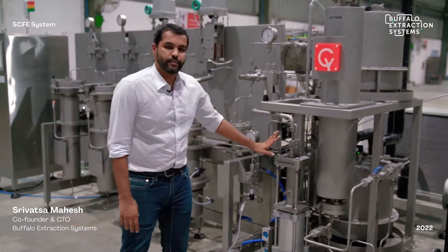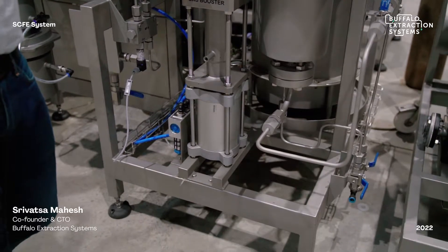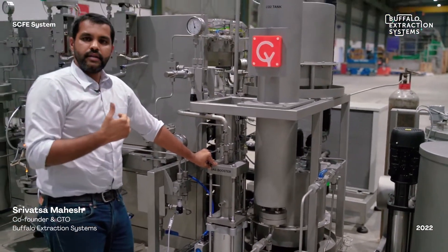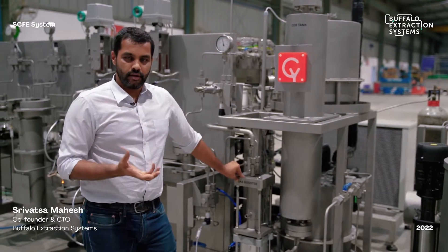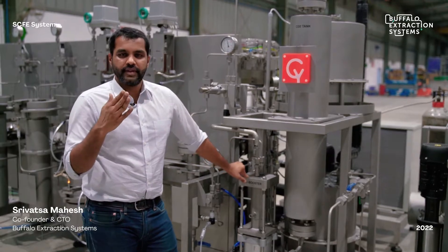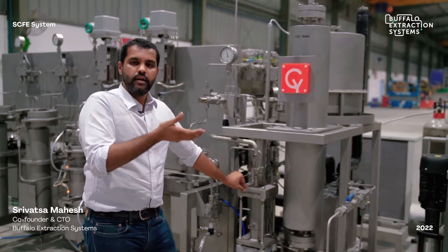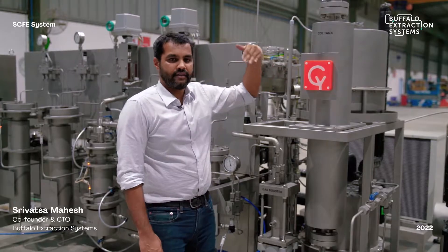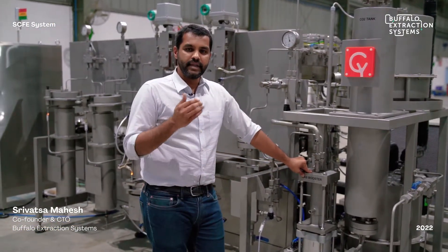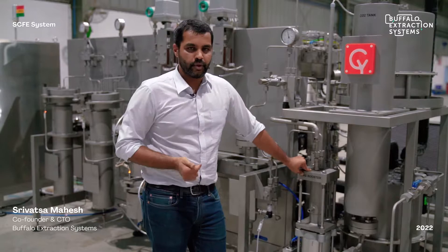We also have a gas booster which serves two purposes: first, to pull CO2 from your storage tanks into the system, and second, to recover CO2 from a completed batch. For example, after completing extraction with Extractor 1 and starting Extractor 2, the gas booster can remove all CO2 from Extractor 1 and recover it back into the CO2 tank or storage, minimizing overall CO2 consumption and reducing venting to atmosphere.